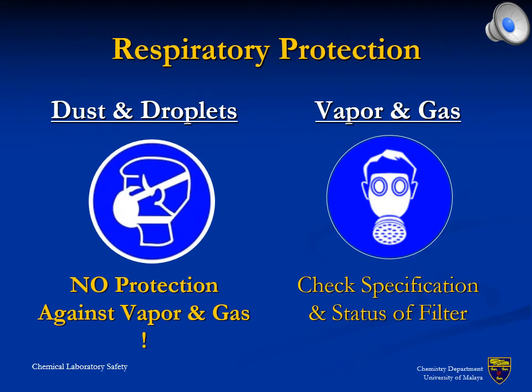A common misperception applies for protection masks. The use of surgical masks as protection against chemicals only applies for dust and droplets. While such masks may be useful for operation with fine powders and possibly nanomaterial, they do not provide any protection against toxic vapors or gas. A non-suitable mask effectively increases danger rather than reducing it, because it suggests a non-existing protection, which reduces the level of alertness.